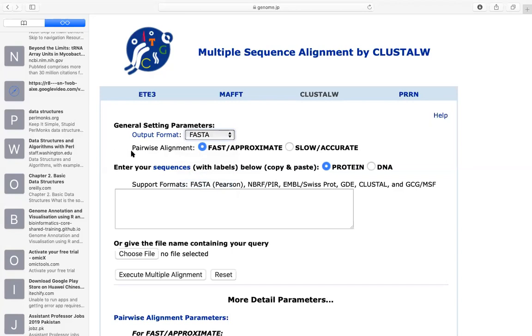In pairwise alignment, you can select fast or slow and accurate. Fast is approximate — you know the difference between approximate and accurate. If you choose slow, it is more time-consuming but the results will be accurate. I think we should always prefer slow but accurate results. The results should be accurate.